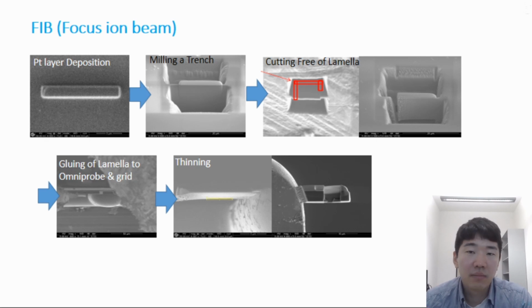In practice, you need to think about many details, which is why I am preparing another lecture for that. So this is all for today, but I very briefly went through these to show you the entire picture of sample preparation. In the future, as I told you, I will individually select one topic and go a little bit deeper. For the first one, maybe I will prepare focused ion beam sample preparation, which is nowadays very popular for many kinds of materials.